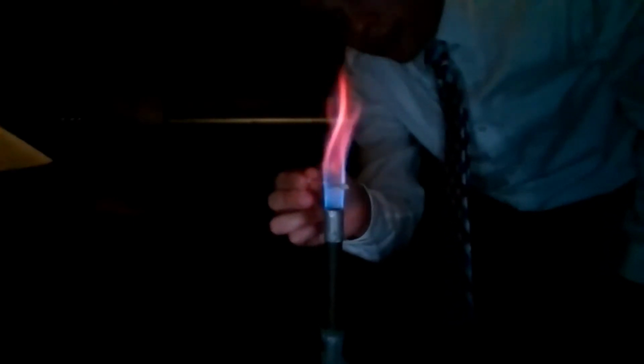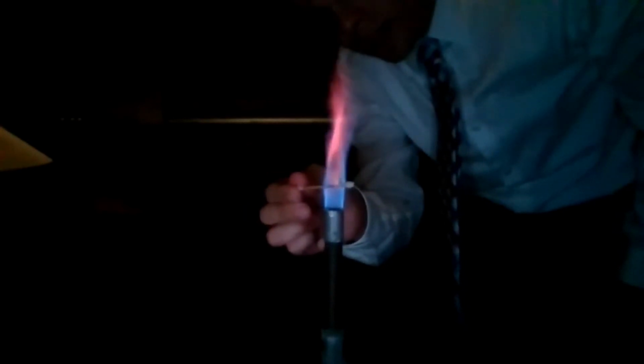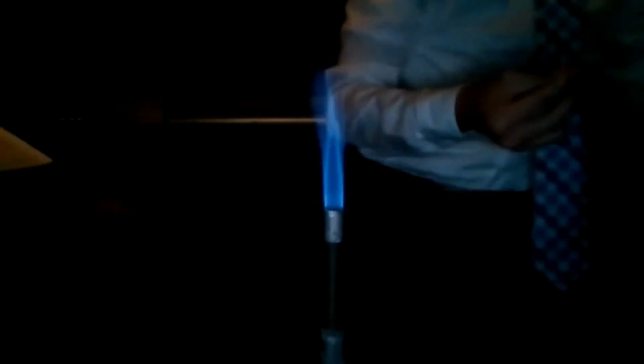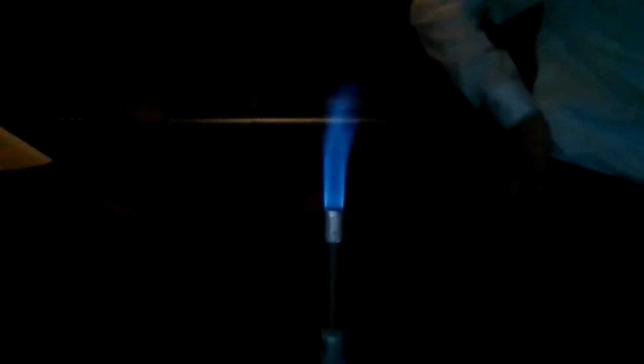A tiny spark of orange. It's like an orange or almost like an orangey red, right? There we go. Now the calcium's burning. So the calcium burns that orangey red kind of color. Almost caught my little Q-tip on fire there.